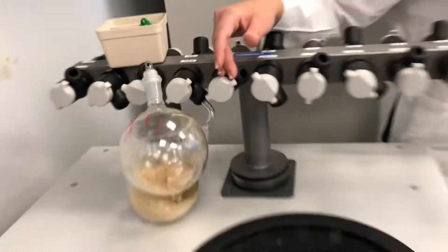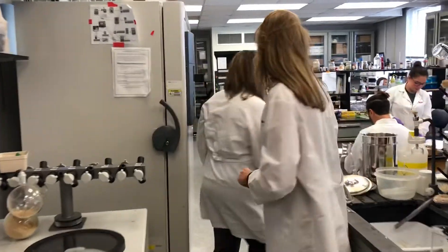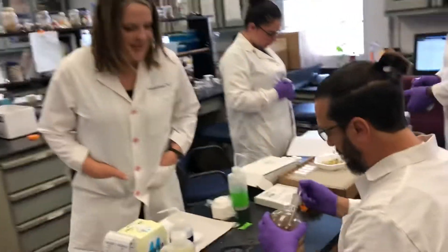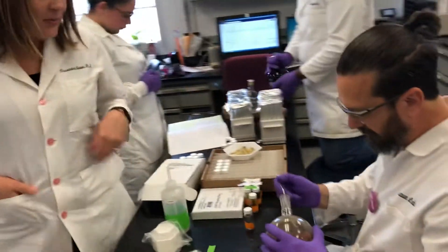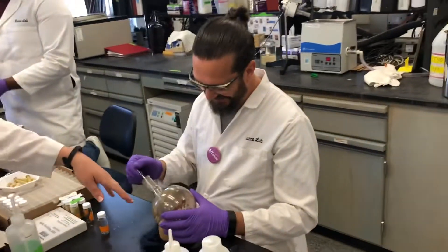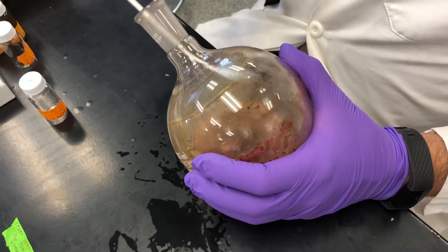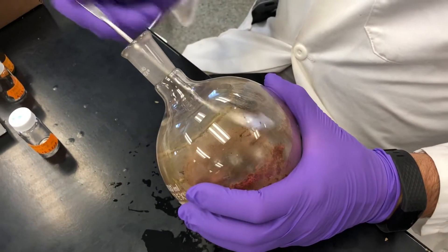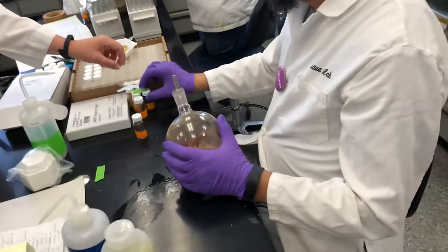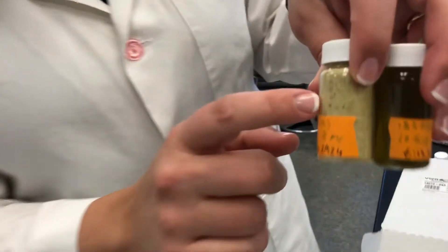Over here, Marco is scraping the flask with a little glass scraper system. It's a little bit of manual work to get these out, but in the end this is what it looks like — a nice fluffy powder.